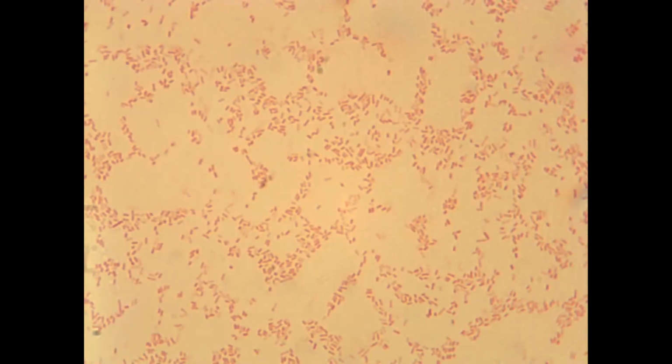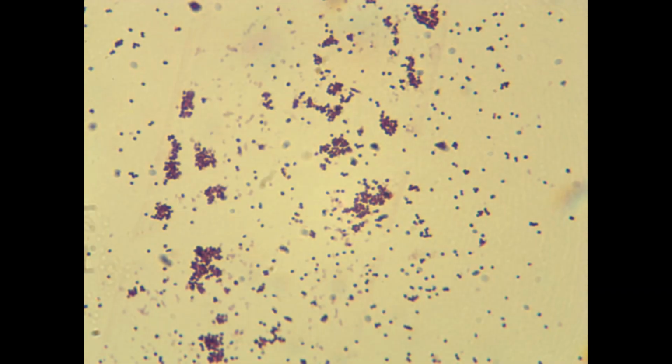Here we can see another rod-shaped bacteria, but this time it's stained a pinkish red colour, which means that it's a gram-negative organism, and this organism is Escherichia coli. Finally, we have another example of a gram-positive organism, this time very different in shape to the Bacillus subtilis. This organism is coccoid in form, which means that it is round. This organism is Staphylococcus aureus.